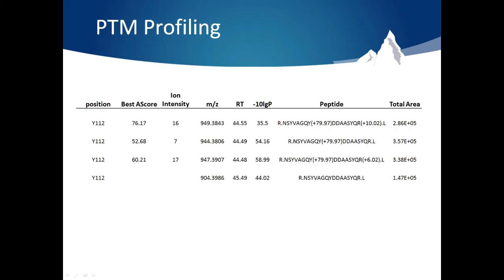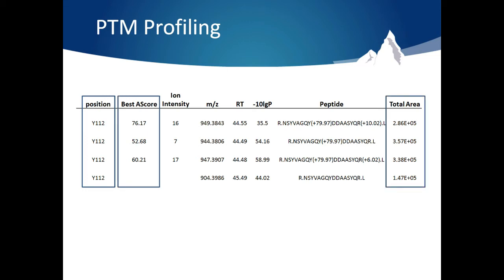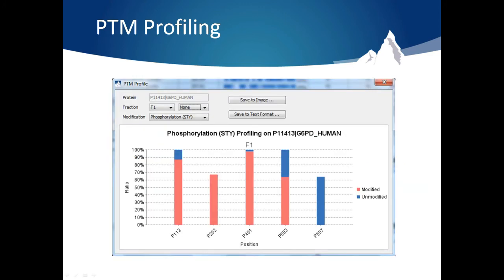It will also repeat this for all of the modified and unmodified peptides found at this position in the protein. This table shows all of the modified and unmodified peptides which are found at this position. The A-scores are reported for each modified peptide, and the peptide feature area is given as well. Using this information, PEAKS creates a bar chart that gives a ratio of the relative quantity of phosphorylated peptide versus unphosphorylated peptide at each identified phosphorylation position. Only fully digested peptides are used in this chart to give added accuracy.